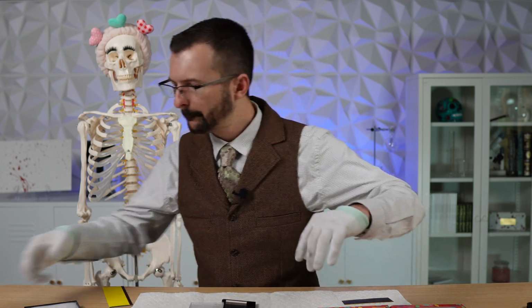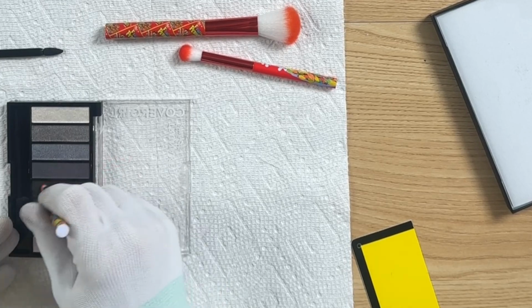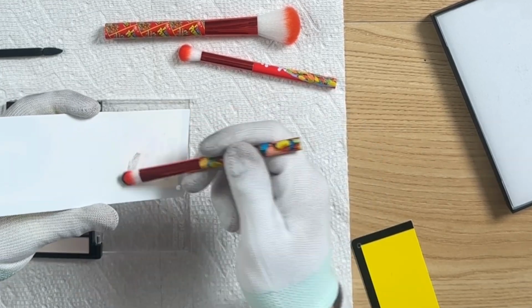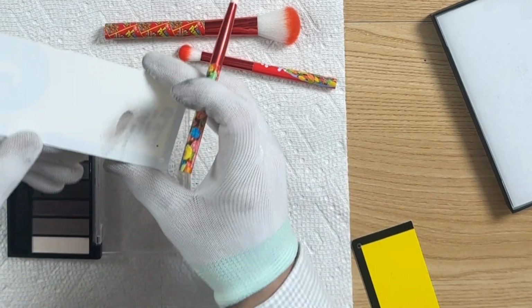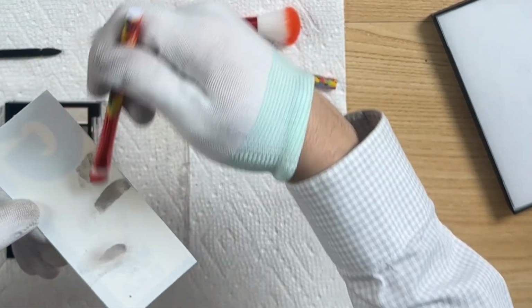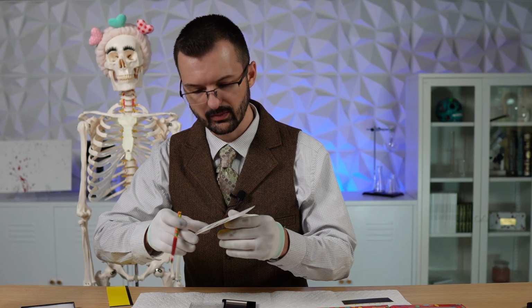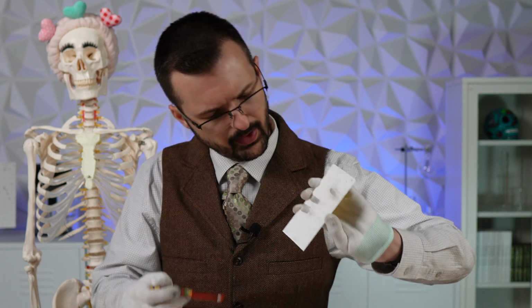All right, so let's take a new, tiny brush. We're gonna take the white plastic. We're gonna take the black powder. Oh yeah. Oh, that's good. Oh, that's really thick. Okay. Hey, there we go. We just needed a darker powder. Look at that. Oh, that looks awesome. There's some great ridge detail. Check that out. Yes. For science, get a little bit more powder.